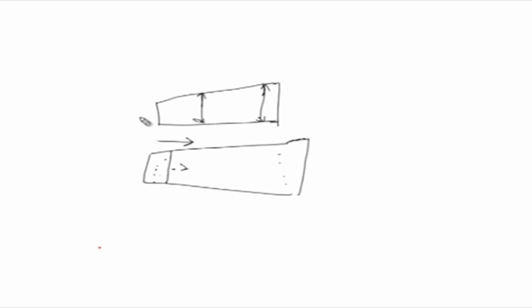What you get is, you start with a sharp peak, but as this peak moves, the height of the peak starts diminishing, and subsequently the peak spreads out, and finally it is quite spread out, because of the shape of the cell. The Schlieren system is very widely used, likewise the absorption system, depending on your application.